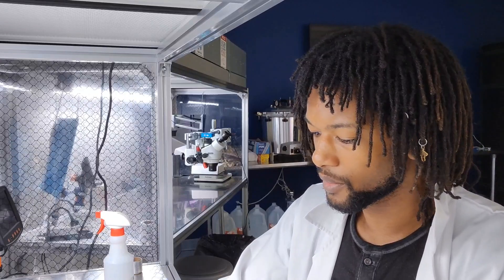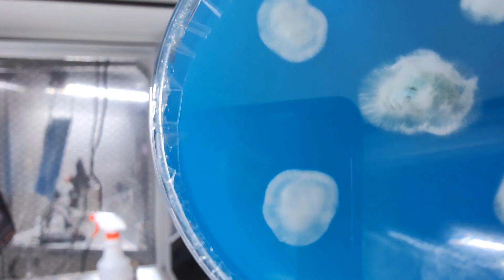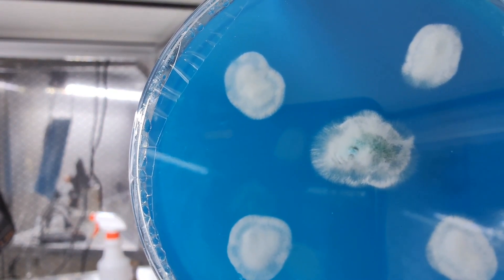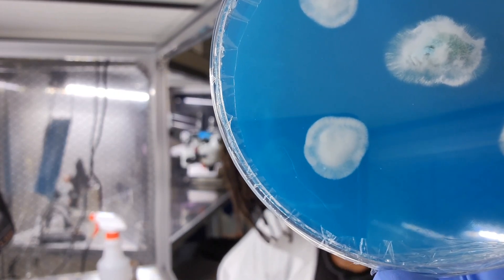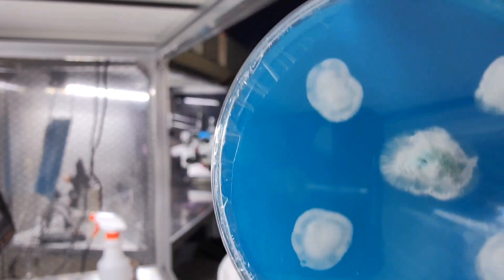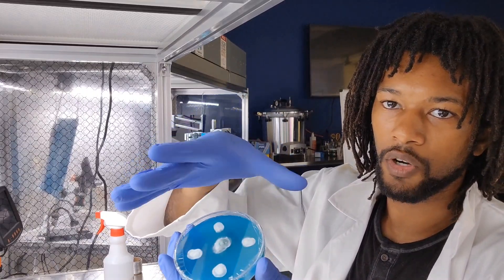We're going to have albino cordyceps here, probably. Really impressed with this one — this is very dense. I love how you can see the difference in growth: the clone is nowhere near as dense as the fresh germination of spores. I think that'll become a lot more evident as they grow bigger.